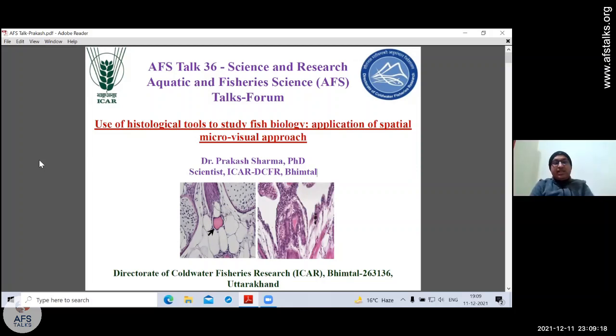Because this has multiple uses, starting from, if I want to study the developmental biology of the fish in terms of the gastrointestinal development, I can use this histology tool. If I want to study the ontogeny of the endocrine system, environmental toxicology, endocrine disruption or microbial histopathology, I can use this tool.